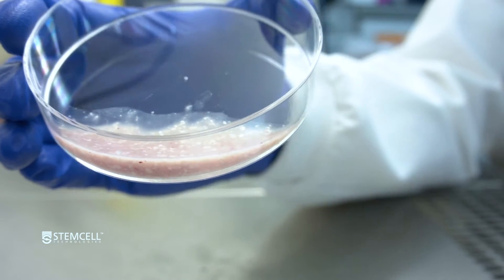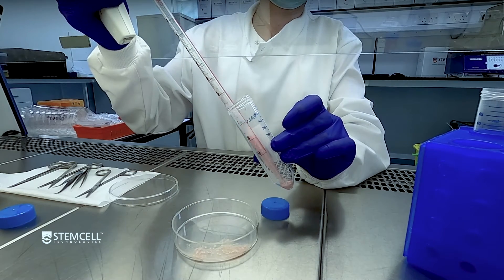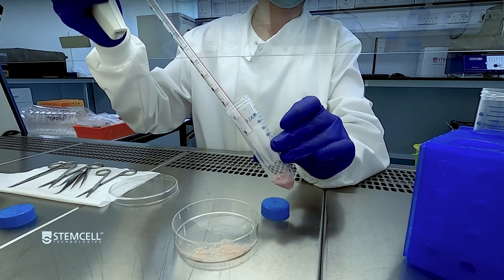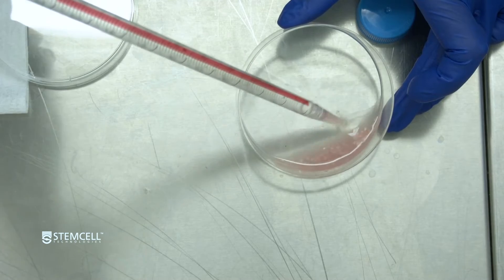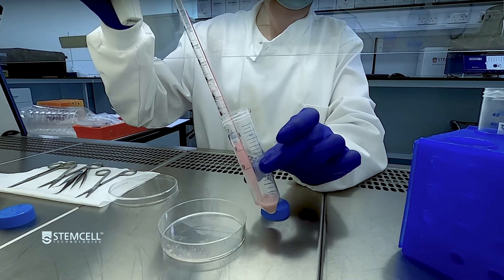Next, transfer the minced brain tissue to a sterile 50 milliliter conical tube. Rinse the dish with the remaining brain digestion medium and then add it to the 50 milliliter conical tube.